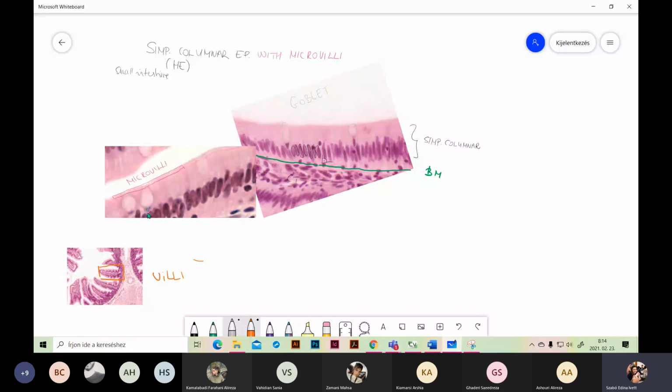And the cytoplasm looks like a bubble. Why is it pale? Because it secretes carbohydrates. This belongs to the other type of epithelium, the glandular epithelium. Glandular cells secrete mucus, which chemically is a carbohydrate. That's why it has a pale color.